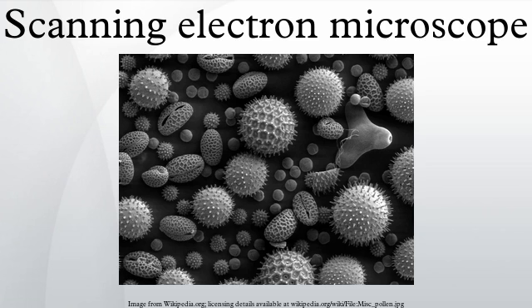The Everhart-Thornley detector, which is normally positioned to one side of the specimen, is inefficient for the detection of backscattered electrons because few such electrons are emitted in the solid angle subtended by the detector, and because the positively biased detection grid has little ability to attract the higher energy BSE. Dedicated backscattered electron detectors are positioned above the sample in a donut-type arrangement, concentric with the electron beam, maximizing the solid angle of collection. BSE detectors are usually either of scintillator or of semiconductor types.